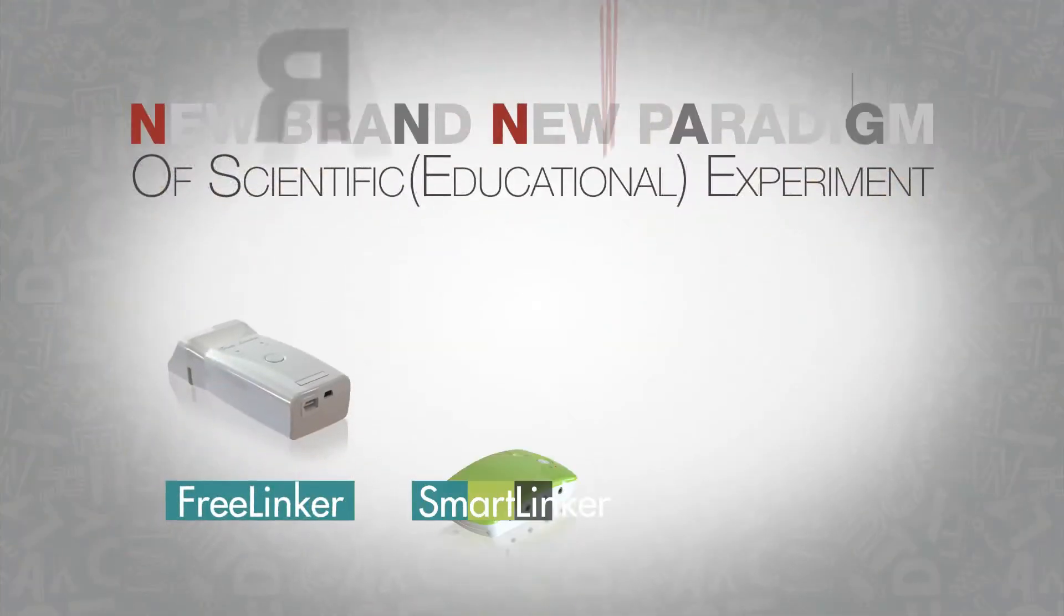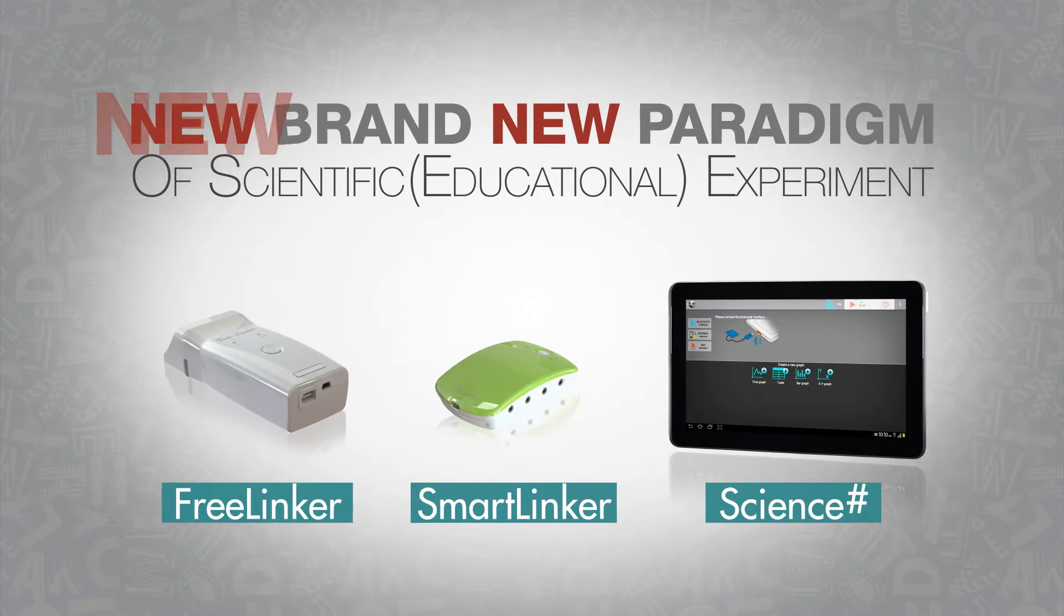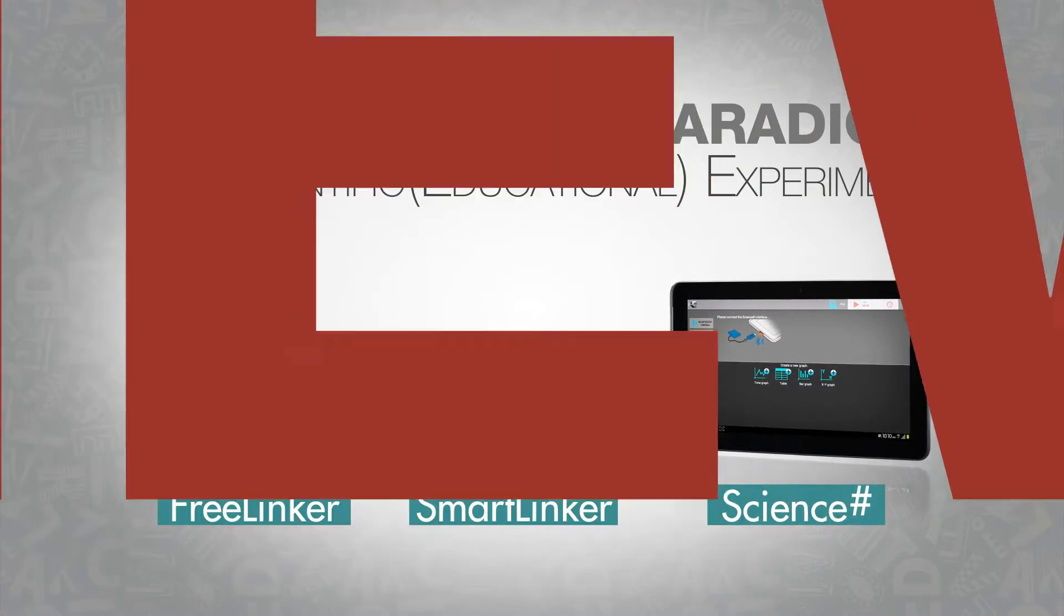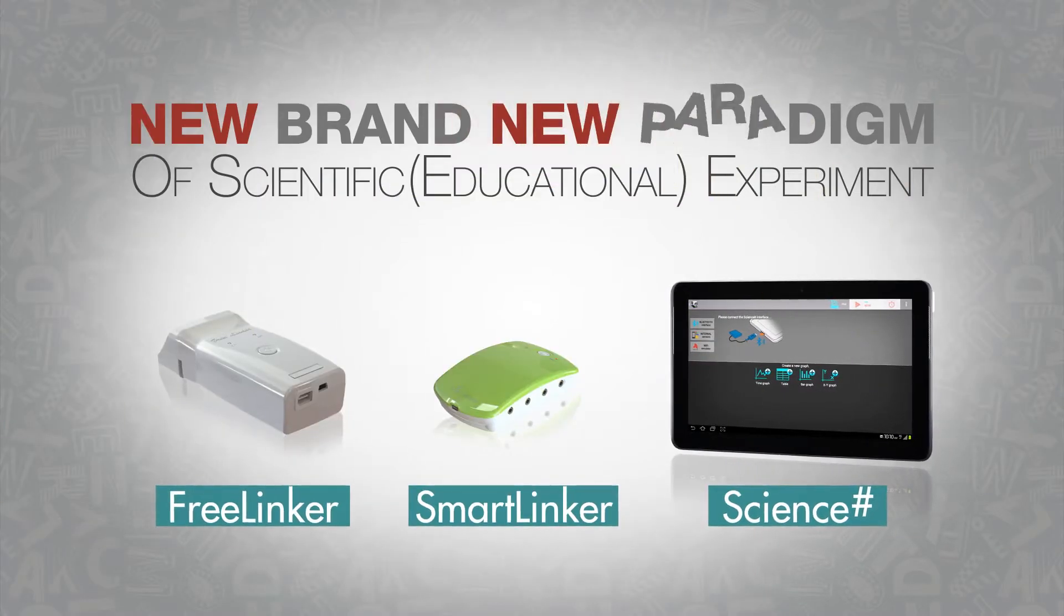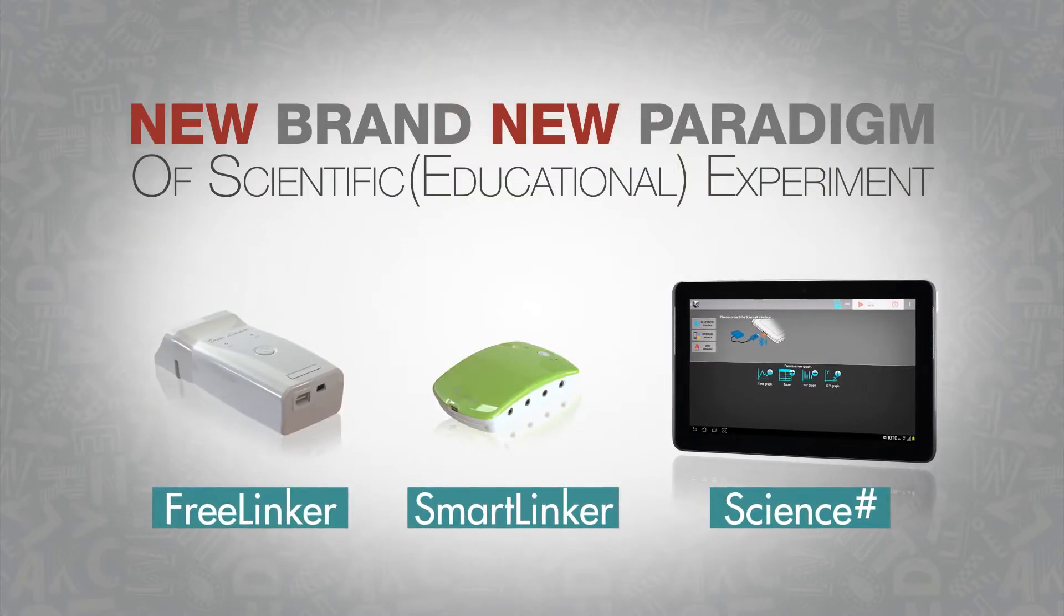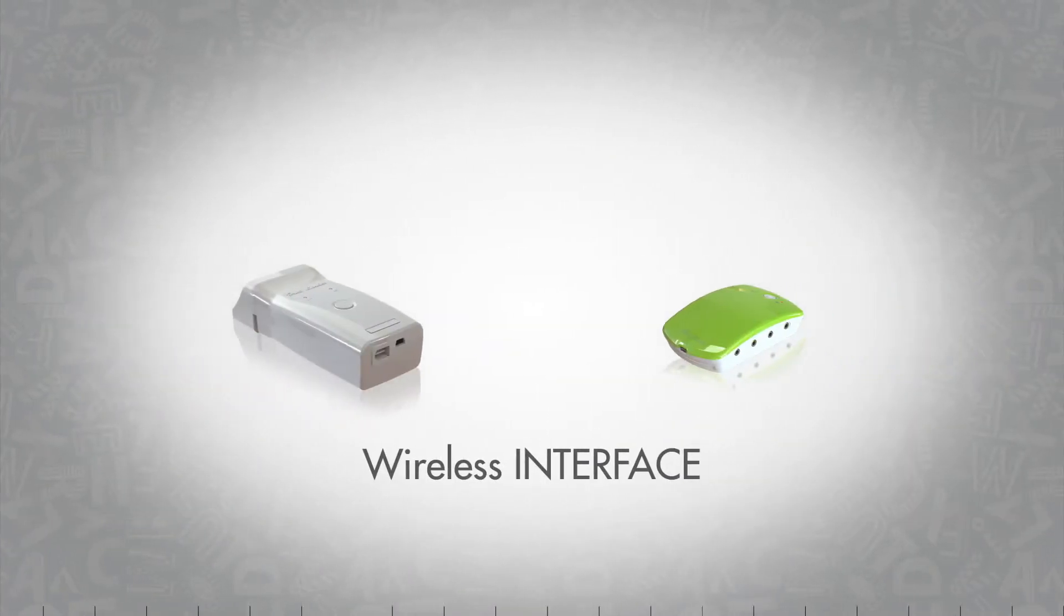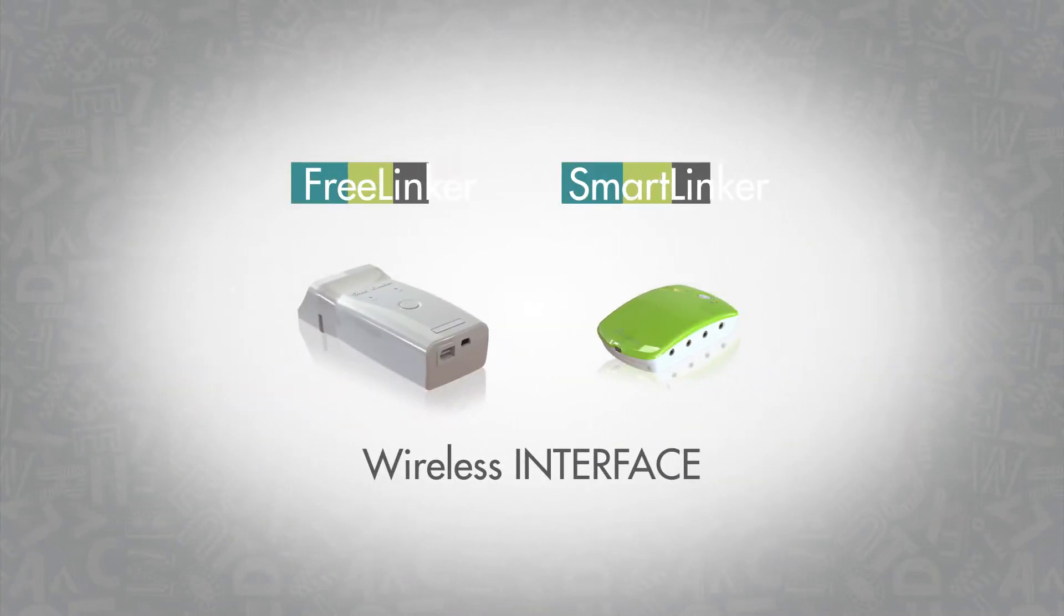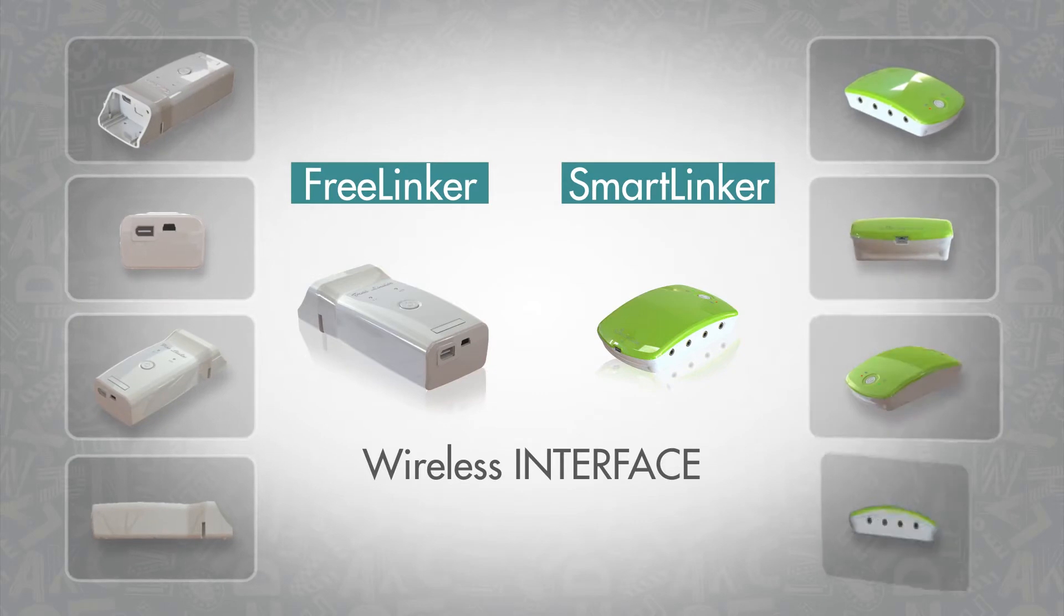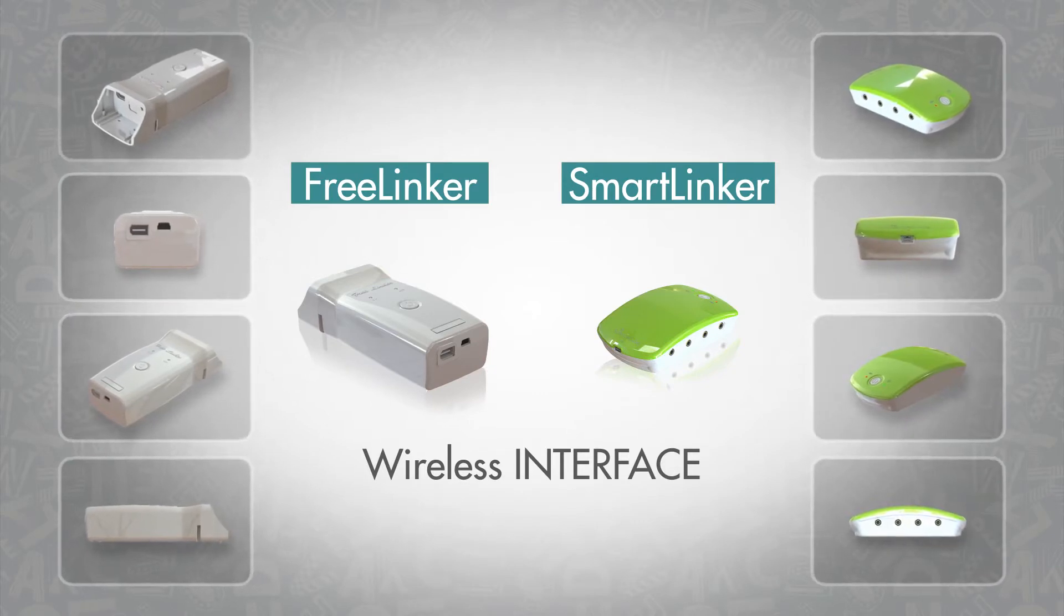Accordingly, Korea Digital introduces more powerful Free Linker, Smart Linker, and Science Sharp as a new paradigm of science experimental education. The wireless interface is divided into Free Linker for MBL sensor and Smart Linker for SMBL sensor.